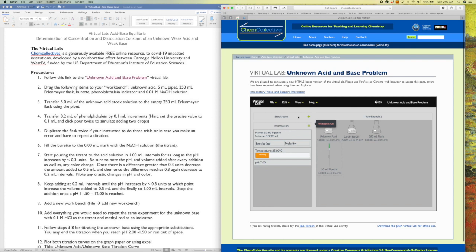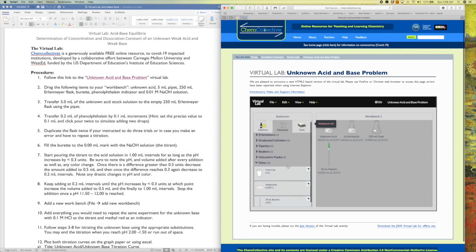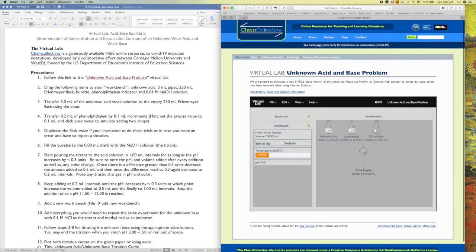And so let's see if that helped. It wanted to do that anyway, I think, but I wanted to force this because I know some of you might come across it, and I didn't want you to panic. So let's try this burette again. It doesn't like where I placed it, so let's see. I'm going to put it here.